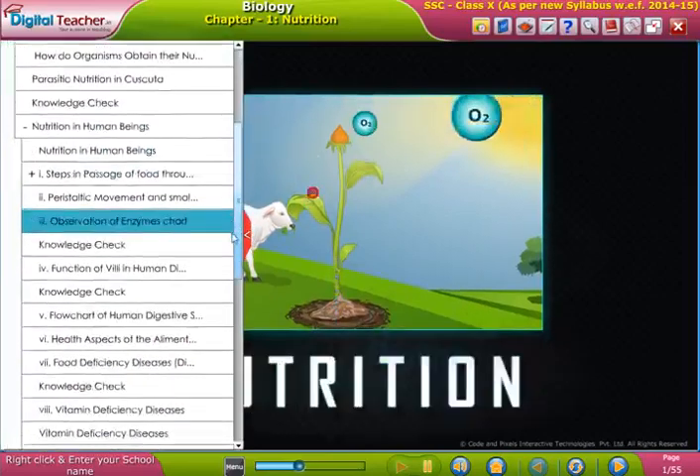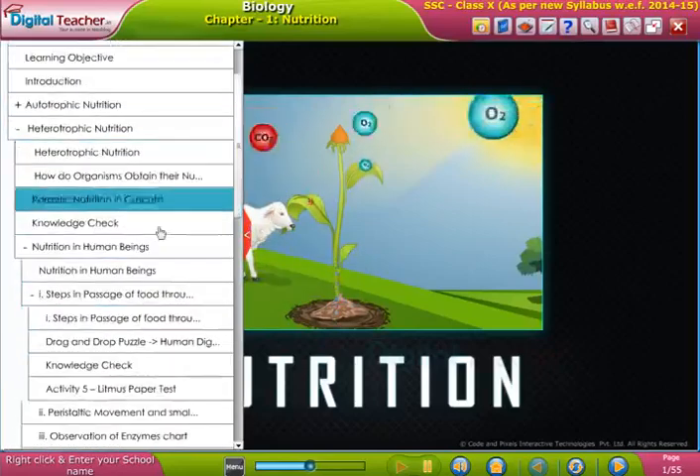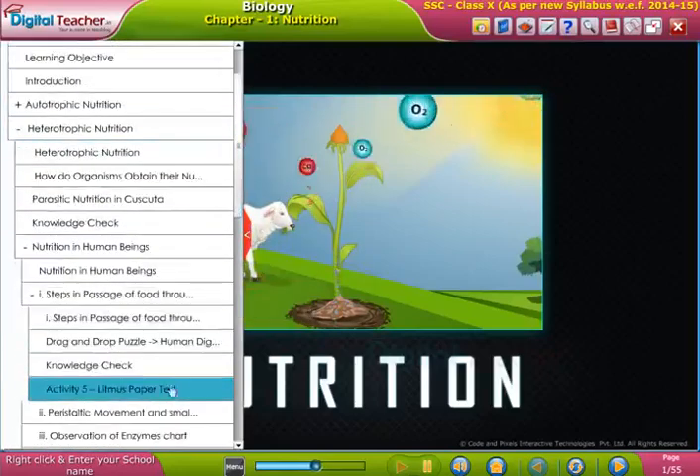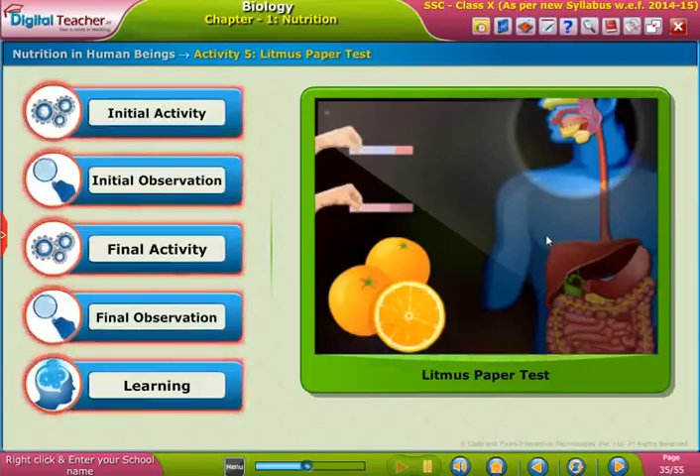Welcome to the chapter on nutrition. Here, let us perform an activity where the acidic and basic nature of food materials are tested using litmus paper.